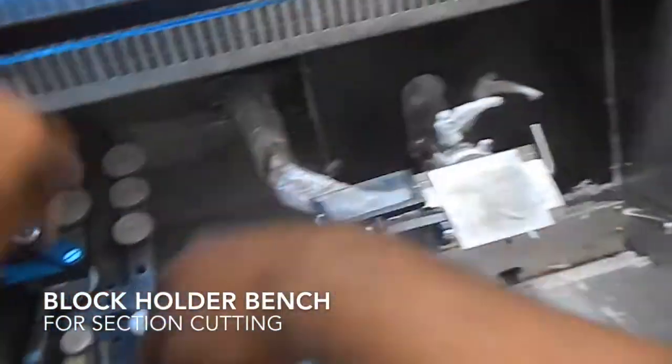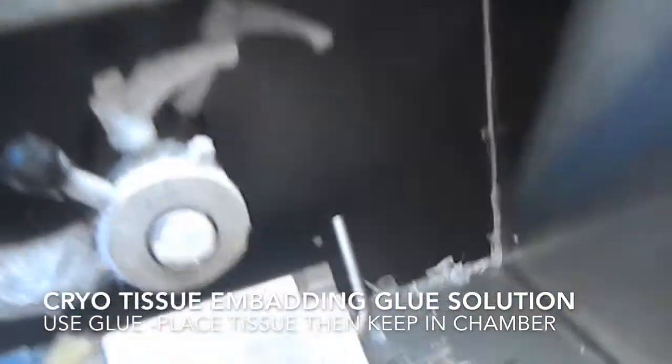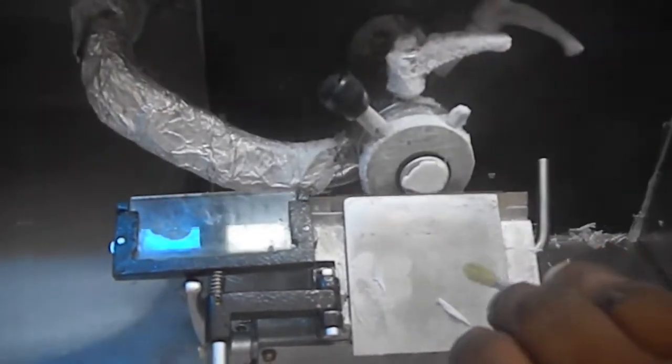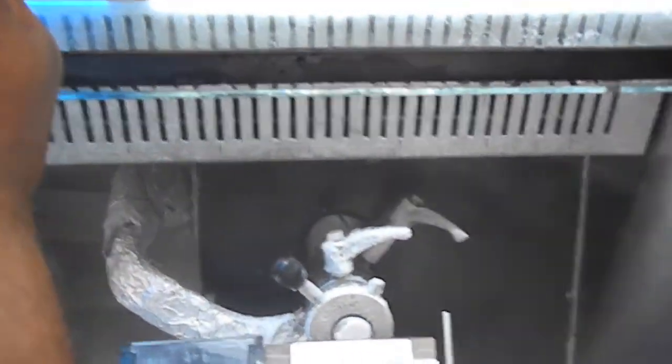Now let us learn the block. First of all, we use the brush with the solution. We have provided the solution here, and blades are like this. The blade cuts here. Now we are cutting the sample. Just see the sample cutting. We can now increase or decrease. This comes closer. By adjusting this, we can make it close to our sample. Now it is just cutting the block.